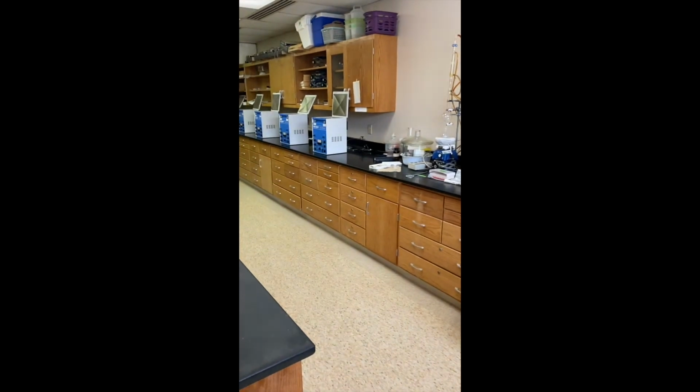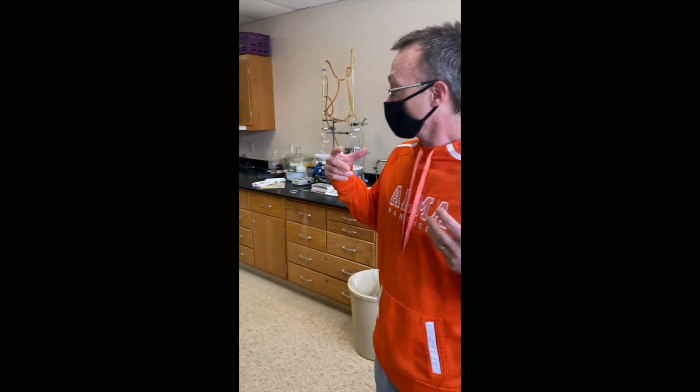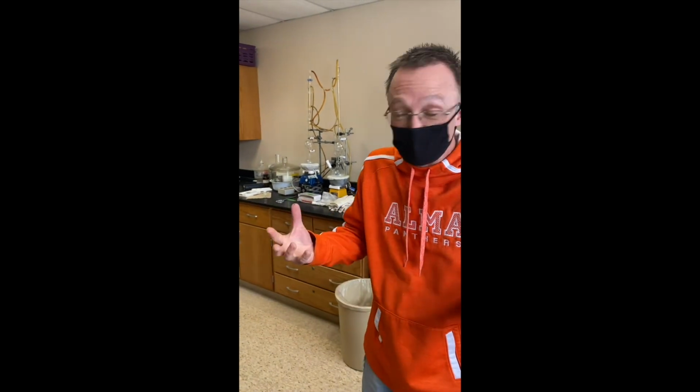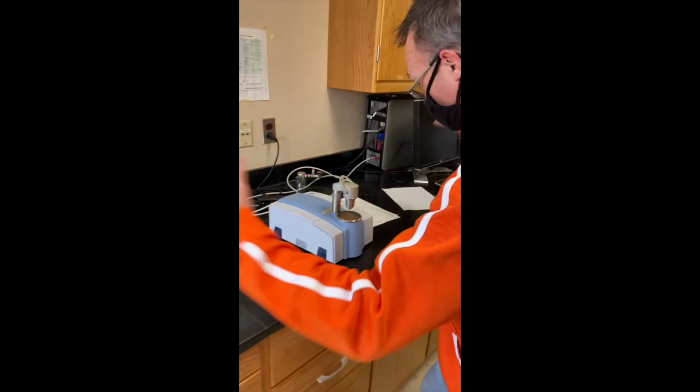This is one of our instrument labs, and when the students perform their chemical experiments, they oftentimes come inside and determine what the purity is. They do some quantitative work. So we have an infrared spectrometer. You know, back in the day, these things were this big, but now look at the thing. It's like cell phones, they're tiny.